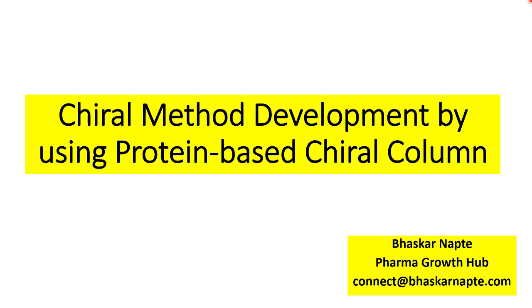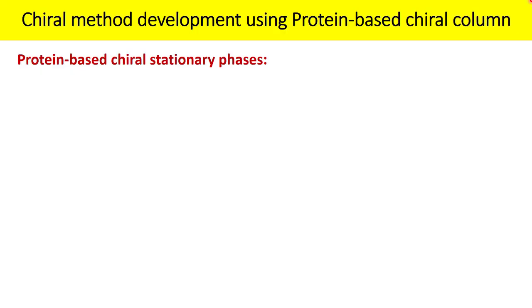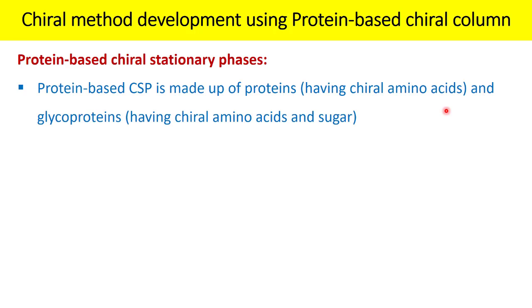So, as a part of this video, we will try to understand how one can develop a method for chiral compounds using a protein-based chiral column. So, let us first understand what is meant by a protein-based chiral column and what the stationary phase contains.